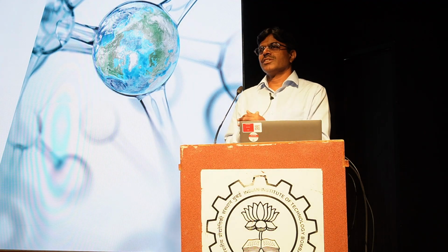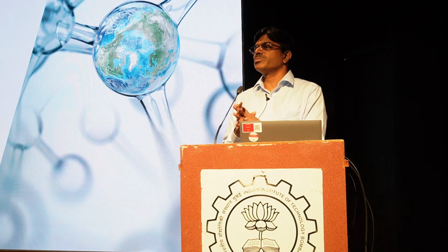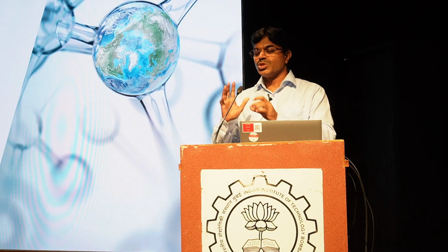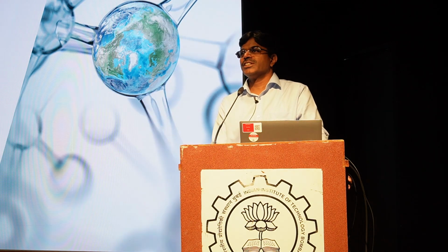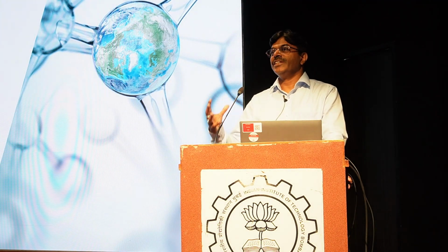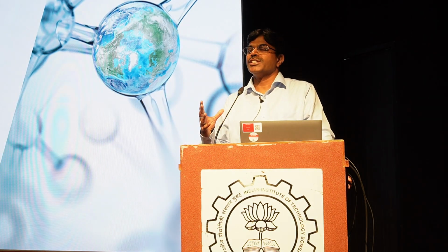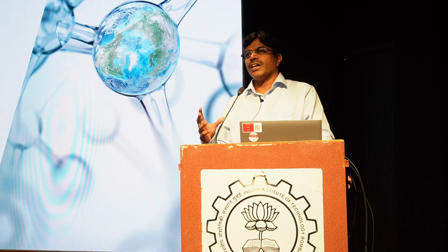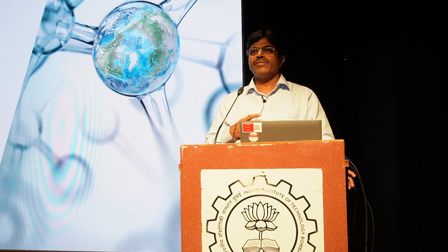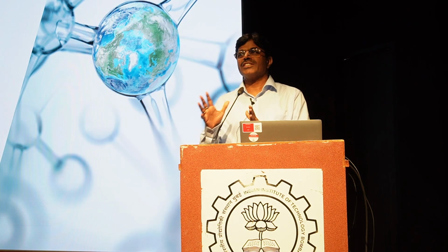In this session, we are going to talk about the basic fundamentals of mass spectrometry and also about high resolution mass spectrometry. Then my colleagues Dr. Daksharat and Dr. Sridhar will deep dive into the application part. We are going to cover applications for persistent organic pollutants, food authenticity, and also pharma applications. We have a mixed crowd, so we will try to touch upon different applications, different segments of the market.